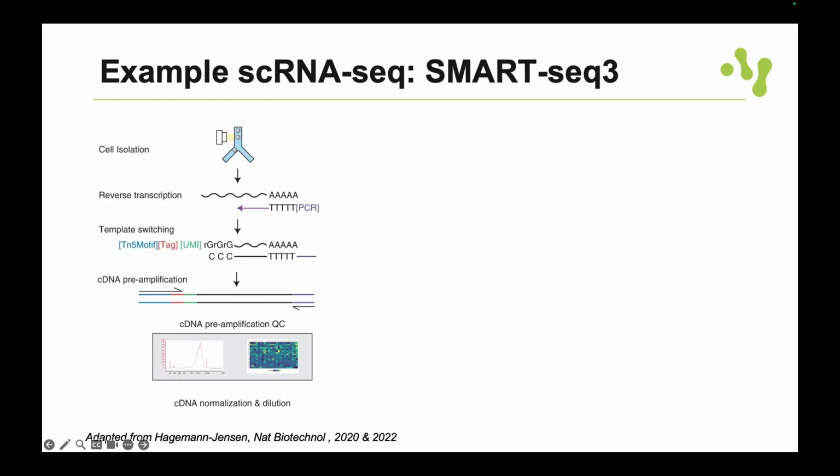During the preparation and the cDNA preparation, the first QC step is enough. But if you have the possibility, I think that is a good way, and then you have good quality RNA. If you already do it, I think you should continue. That's a good practice, unless you change a lot in your library prep, because then it's not useful anyway.